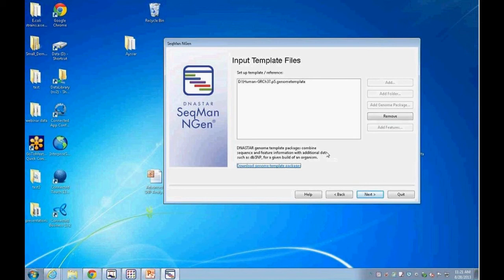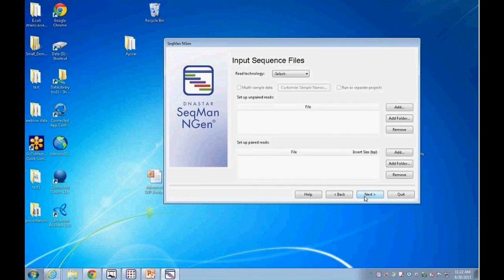So if it's a known position, you can have a stronger probability that the variant is real at those locations versus an unannotated genome. So there are some definite advantages to feeding this information so it's present while the data is streaming through the assembler. It makes for a much more efficient analysis, so all the SNP calculations are going to be pre-flighted and done at assembly time.